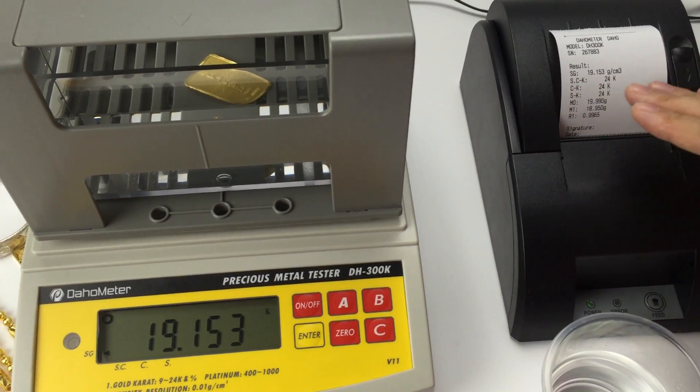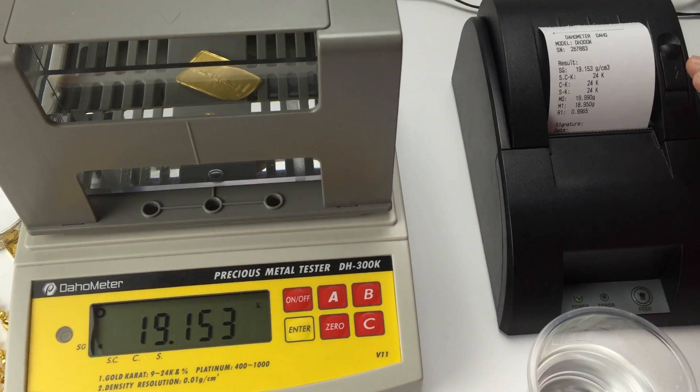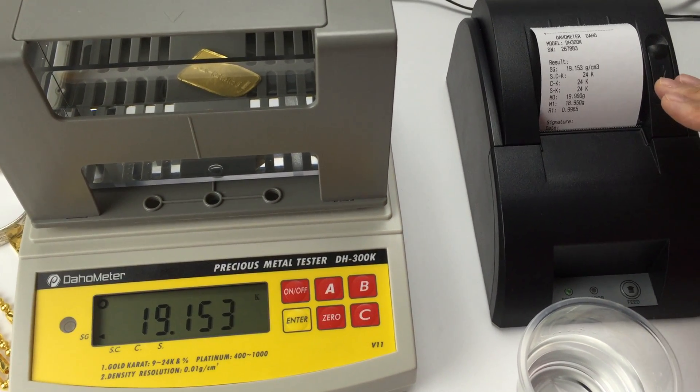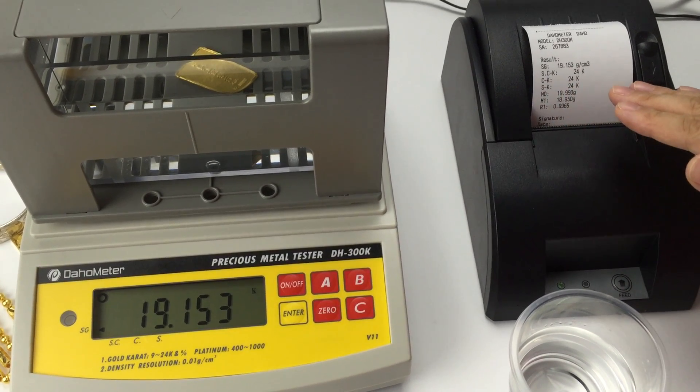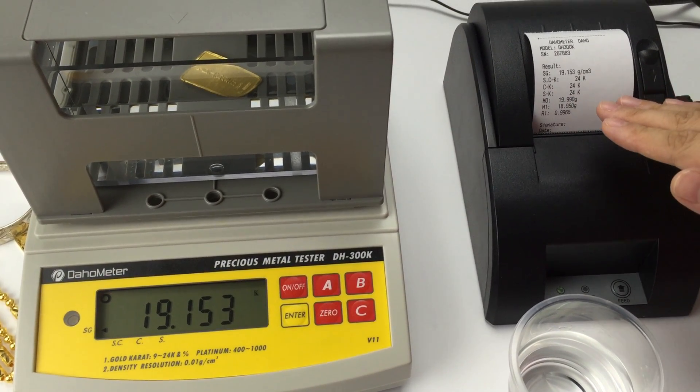S.C.K. 24. This is the K value for gold, silver, copper. C.K. It is the K value for gold, copper.